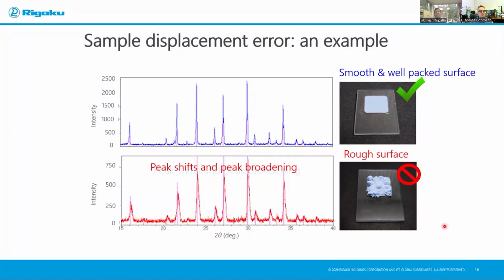But when the sample is just on the sample holder without being prepared well, it can give rise to shadow errors, displacement error, and a number of others. Not only the peaks are not sharp for the same sample as in the previous picture, but also the purple lines from the database are displaced. So such could be the consequences of not preparing a sample very well.